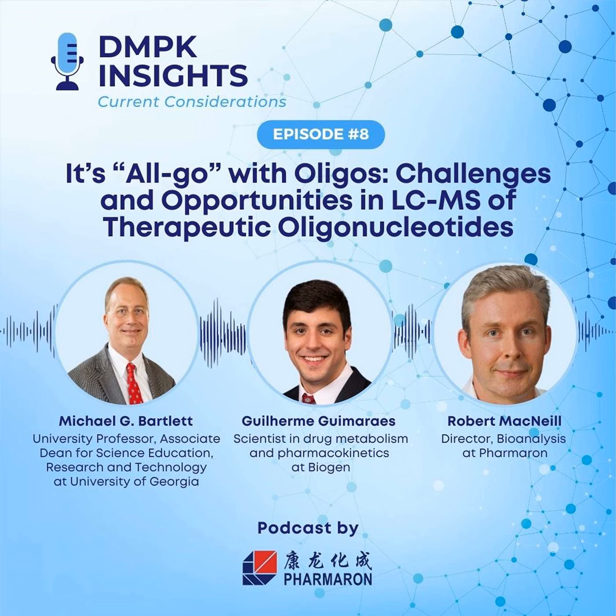I'd just like to add, I think when you're looking at ion pairs, right, they get a lot of merit in their ability and their play on the chromatography side, but I don't think they get enough credit for how they help the desorption of the oligos in the ESI and the mass spec side of things, and how that improves your sensitivity. And so taking them away, as people are well aware, will take a toll on your sensitivity.